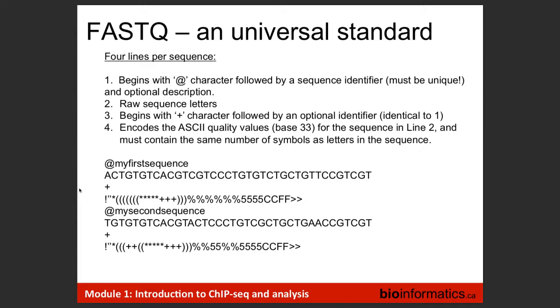And I have no idea why there's a plus. I should maybe look into that. Sometimes they add the sequence information, so it's not just a plus. Sometimes you get a repeat. What I've seen is actually just a repeat of the name, but why would you want to repeat the name?